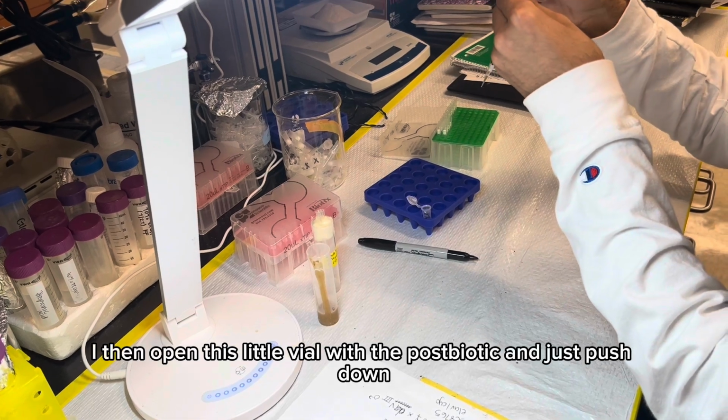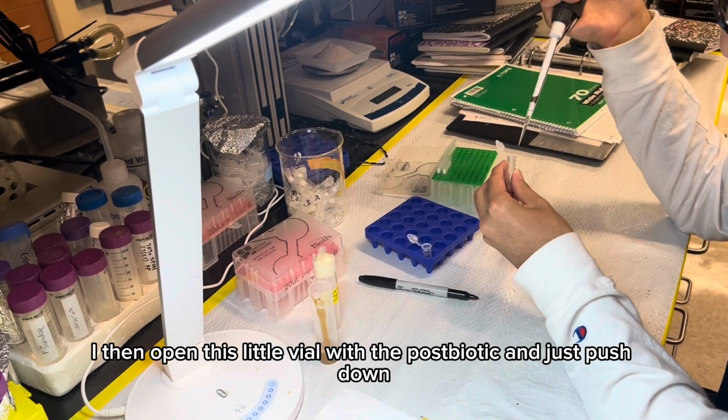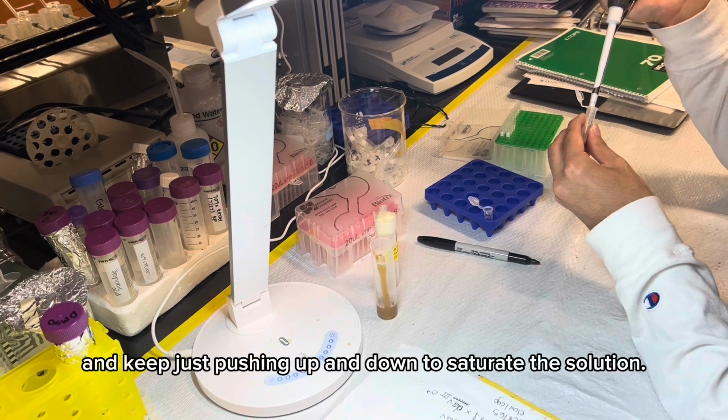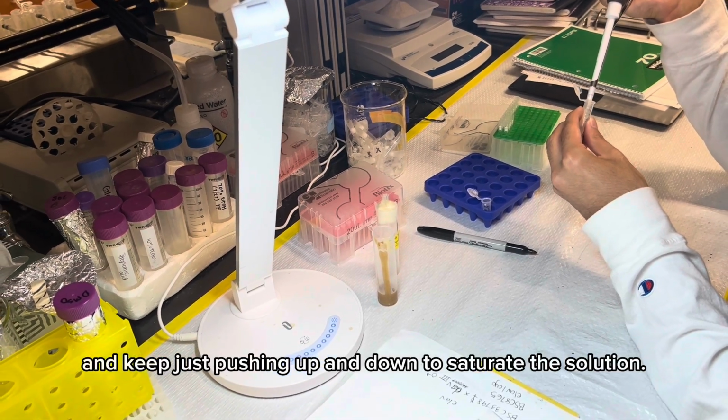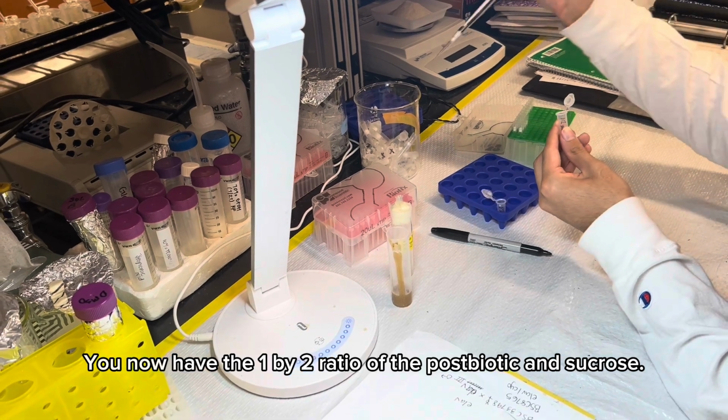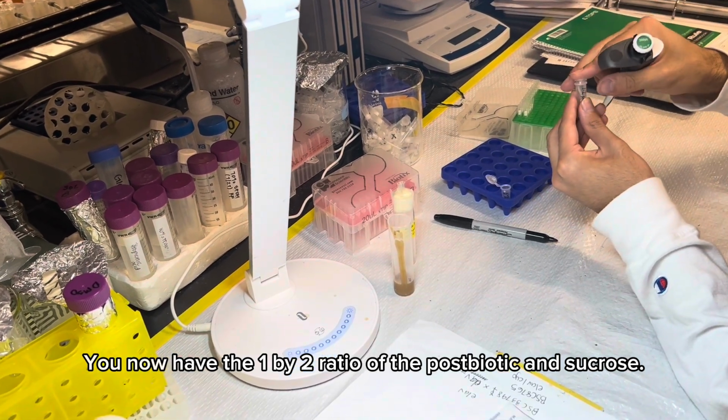Then I just open this little vial with the postbiotic and keep pushing it down to saturate the solution. And then you have the 1:2 ratio of the postbiotic and sucrose.